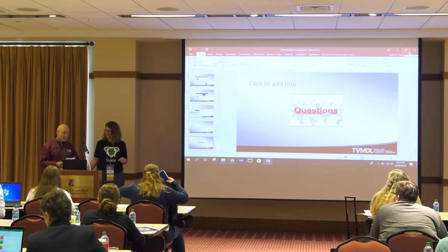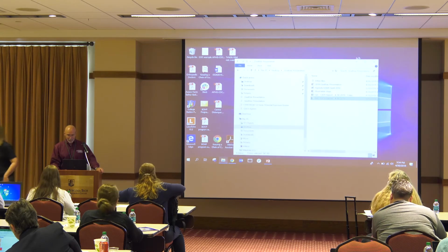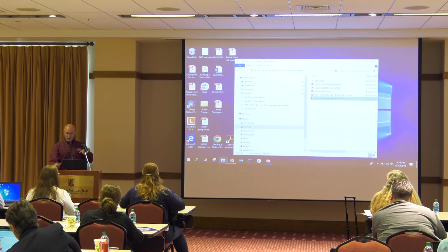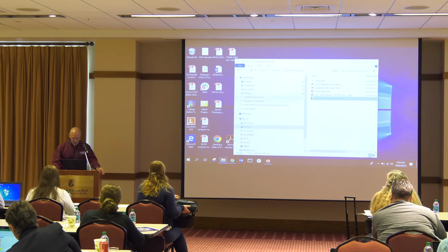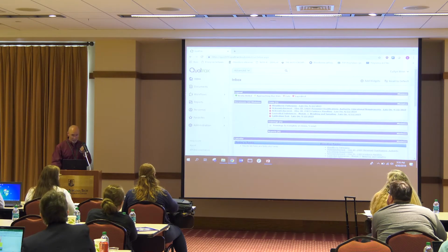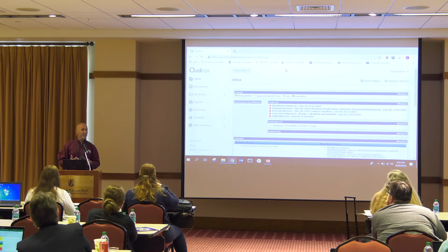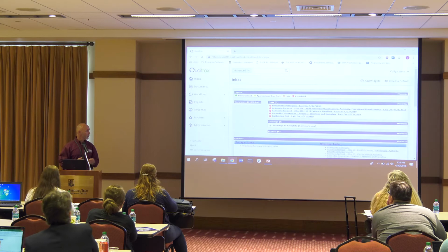Well, I could show something I was piddling with earlier today, something kind of fun. Well, sort of fun. For everybody here in the user group, here is something you can do with pivot tables with the Qualtrax system that's in place. We're talking about taking data and summarizing it, or using pivot tables to summarize this information.